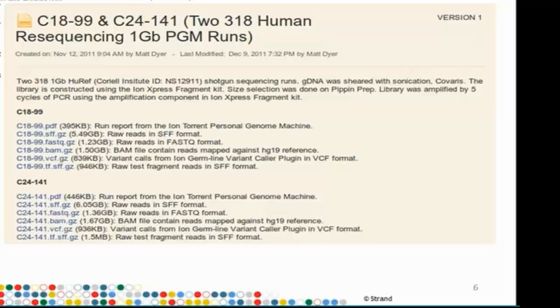So all of this has been covered in other webinars which have discussed the DNA analysis pipeline, webinars where the small RNA analysis pipeline were discussed, etc. So today I will discuss only those data sets which cannot be imported directly, but a little bit of processing is needed before they can be handled within Avadis NGS.